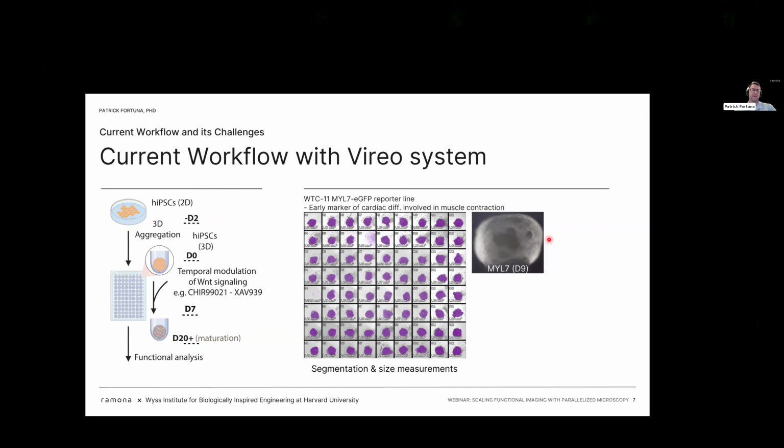This was just with the Echo microscope in the TC lab. But with the segmentation, it's really fast in the sense that you can perform your QC pretty much as you're imaging. So here's just a brief example of 10 random organoids that I picked over the first 4 days of induction. So you can track your measurements, the sizes of your organoids as they're progressing during differentiation.